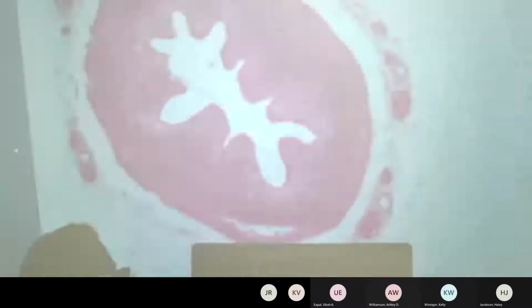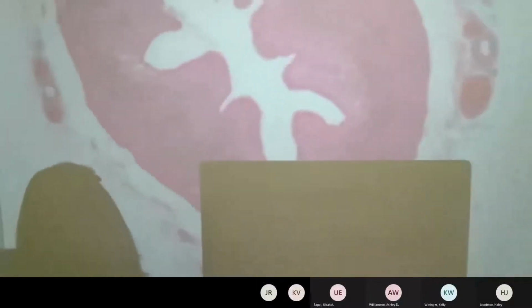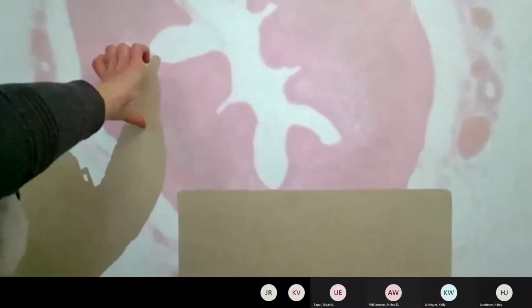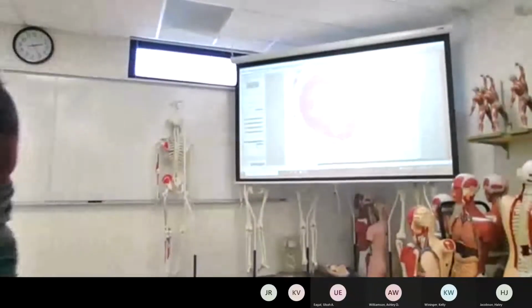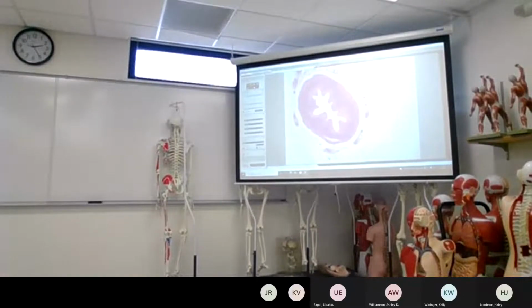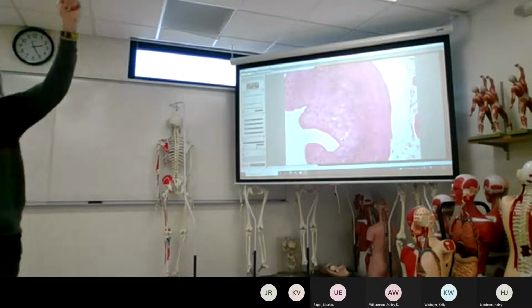This is a ureter, and you can see the ureter is not a hollow open hole. There is some push in, and there is a muscle layer that can dilate and stretch. When they're not stretched, those transitional epithelium cells look pretty cloudlike, big and poofy, but when they are stretched, they may flatten out a bit.